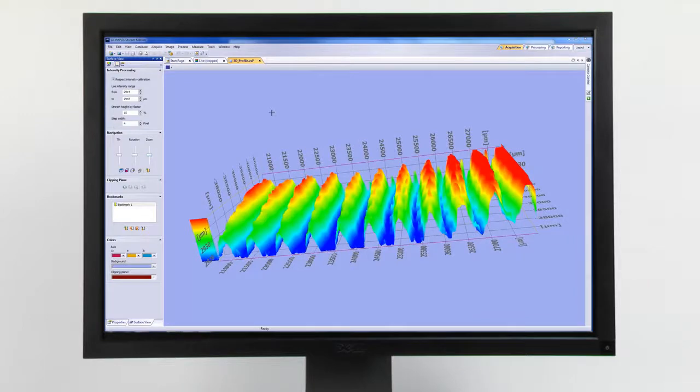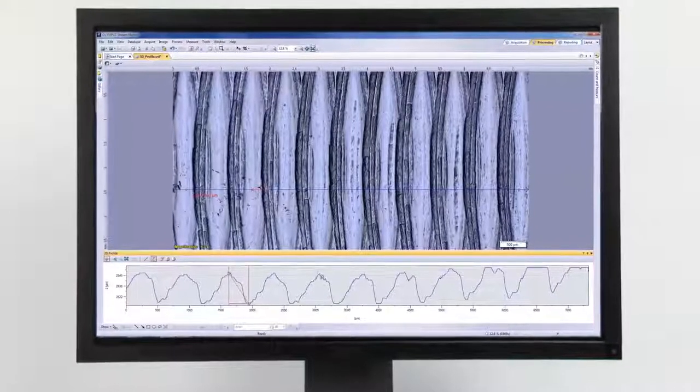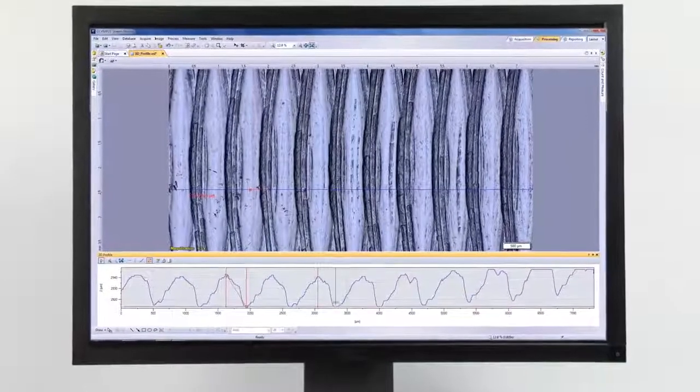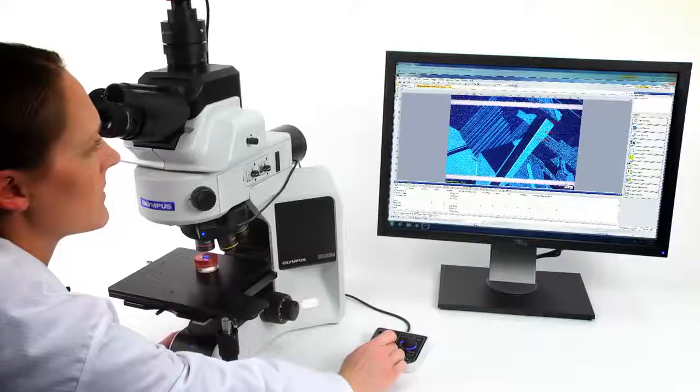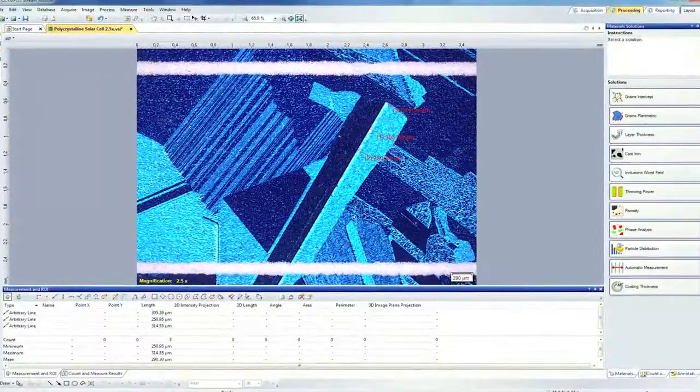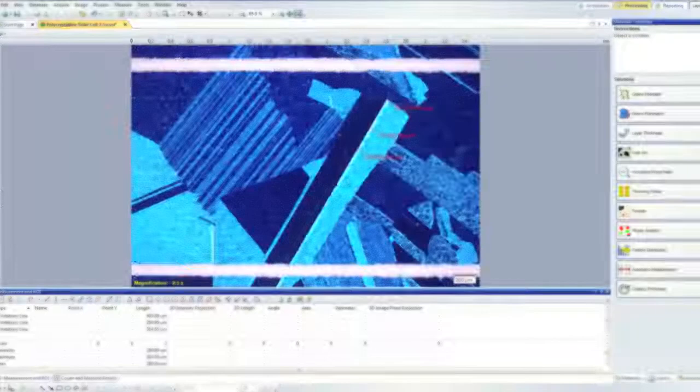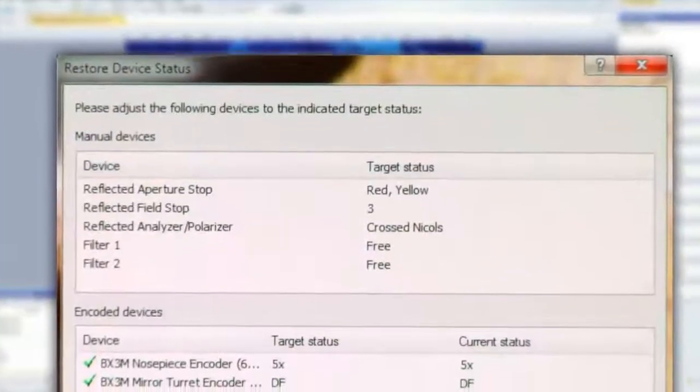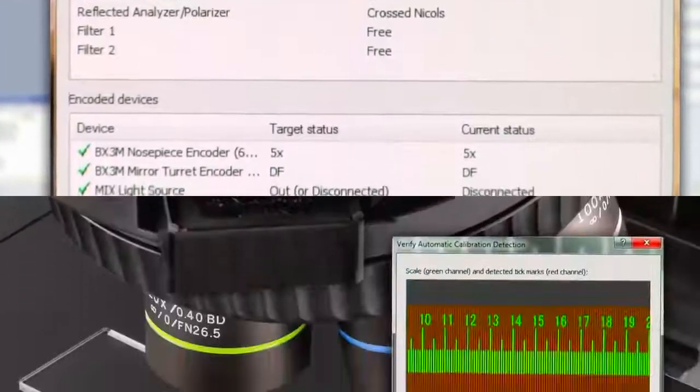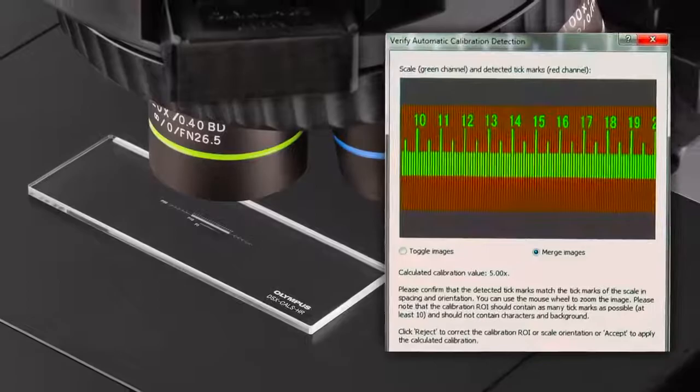And as a color map. When using a Z encoder, measurements can be performed on the profile. New functions in Olympus Stream have improved overall reproducibility and ease of use, such as Restore Device Status and our auto-calibration feature.